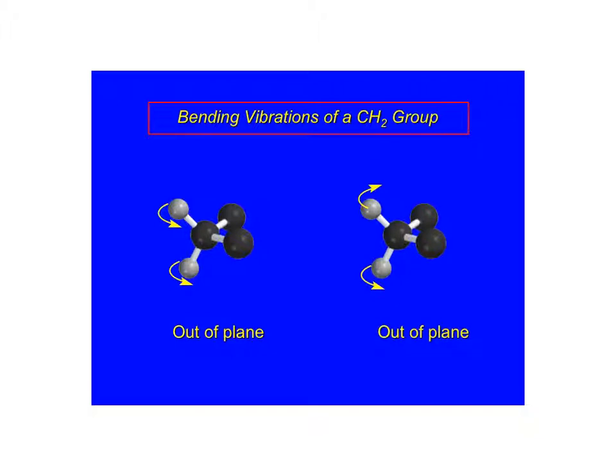And it's these unique characteristics that make a spectrum. And a part of that is even called the fingerprint, because it is unique to every compound. It's unique enough that it can be used for forensic science. For those who've had me for forensic science, we talk a little bit about IR, but we really just call it the chemical fingerprint.